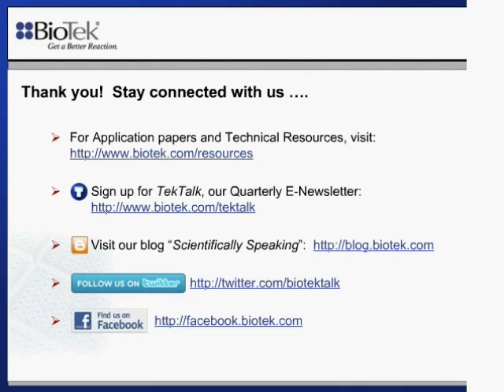With total serum, in a lot of instances you're going to have to dilute it to be able to read it, though it depends on what vessel you read it in. The microvolume analysis is probably a good way to go for this, given the quantity of proteins found in those types of samples, and the microvolume analysis having the smaller path length would probably help out there.